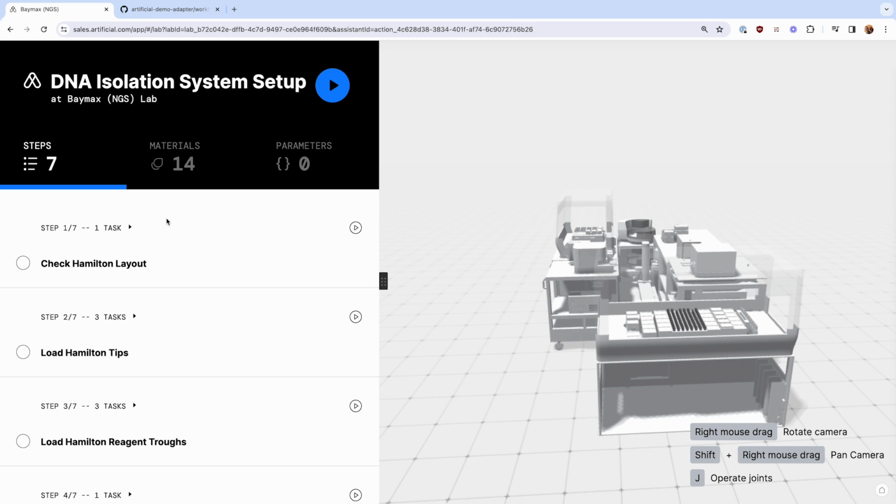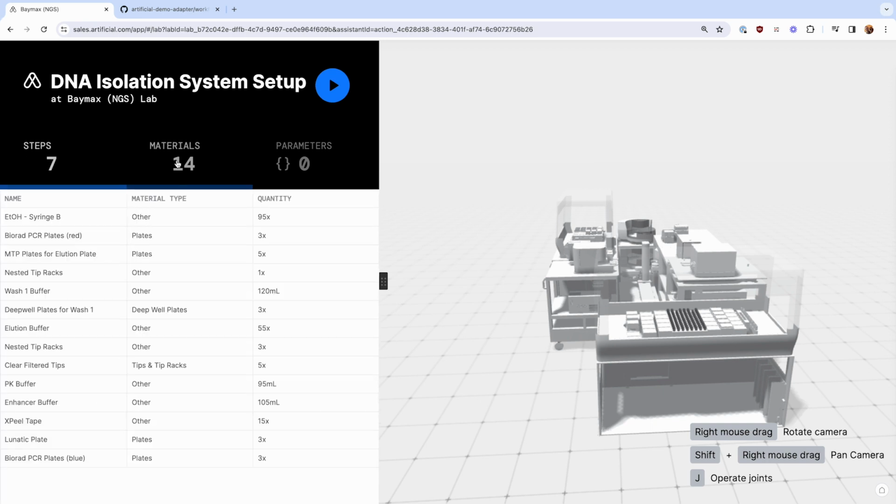Remember, the scientific parameters flow out of the informatics system to our system. The workflow starts to run and can pass parameters into these guides. So we can get very specific guidance based off this specific job and how the requests were batched up and all sorts of other rules. We show the materials you need to collect, and again, in the exact quantities that our system has calculated for this number of sample plates based on the batching for this specific job. So when the operator sees this, it's going to be the right number. And all these calculations are done automatically behind the scenes.